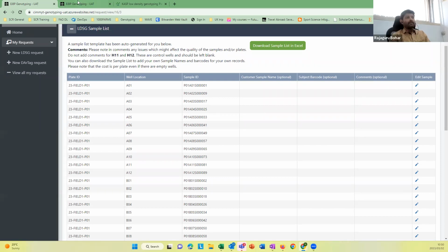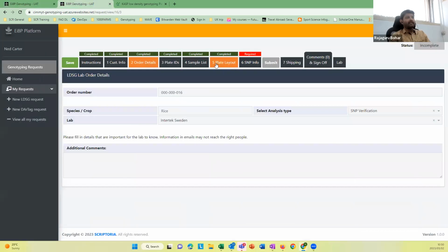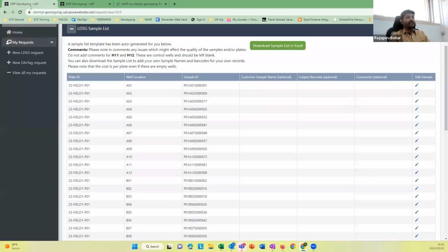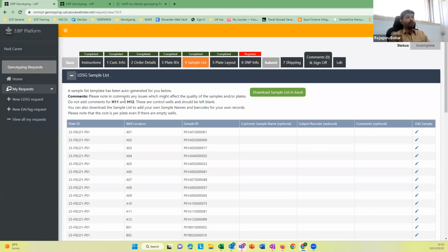Yeah, thanks. So there is a question from Ismail. I think he's also raised his hand. The question is, on the sample file, is the user allowed to upload your own file? Is that the question, Ismail, or do you have additional questions? Yeah, it's not very clear.